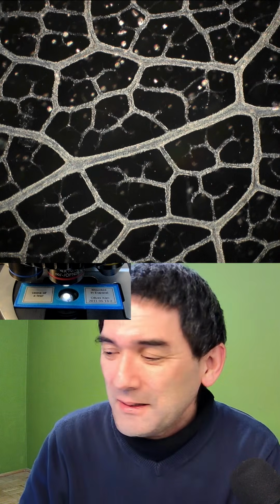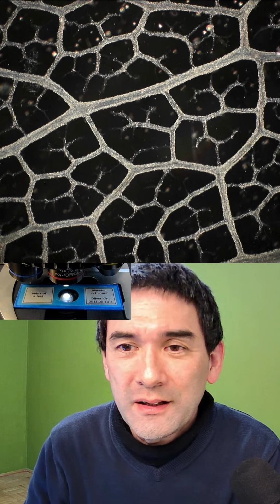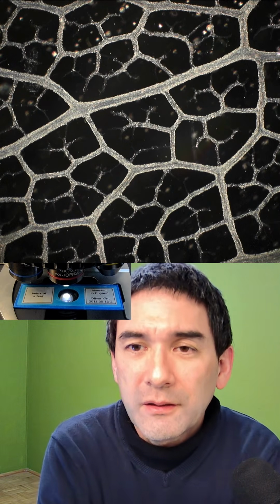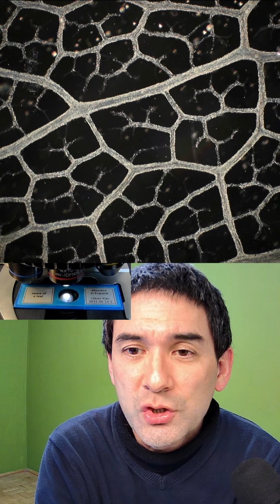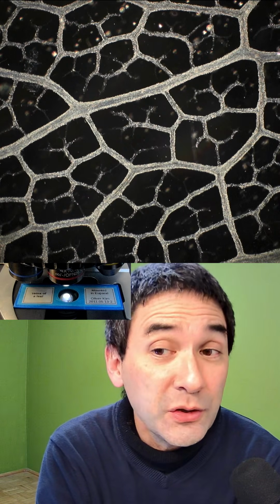There's an interesting comment already that the old red, green, and yellow paper antique slides should be handled with gloves and surfaces cleaned after contact. They often have arsenic in the inks.